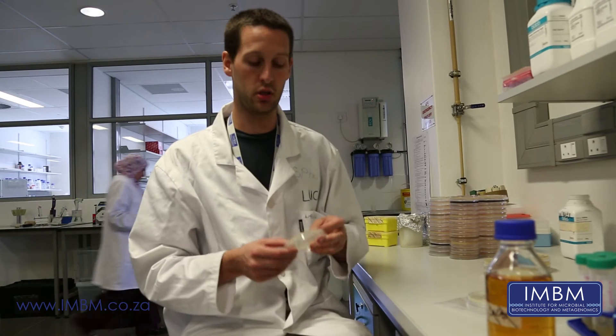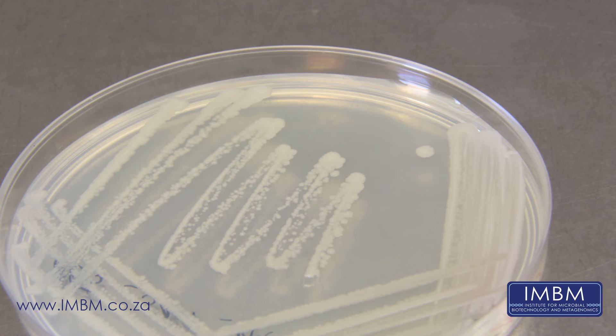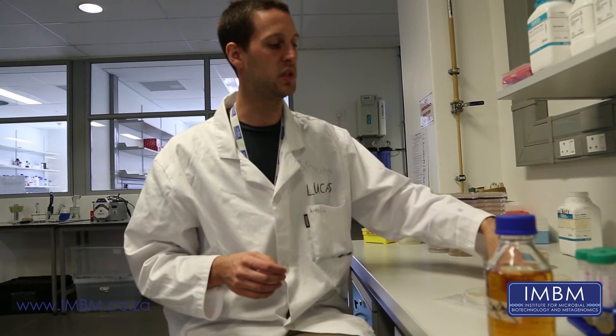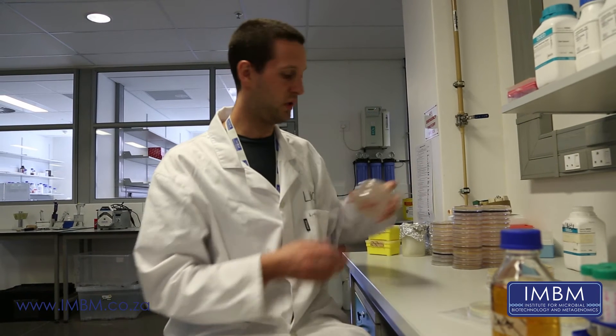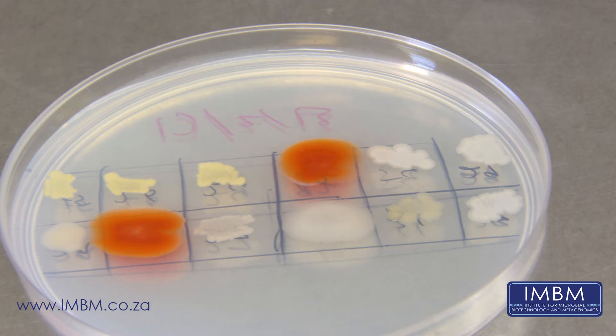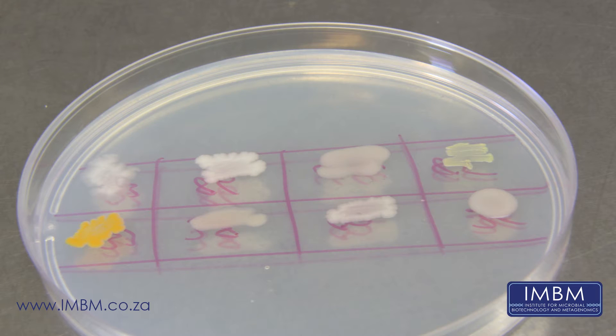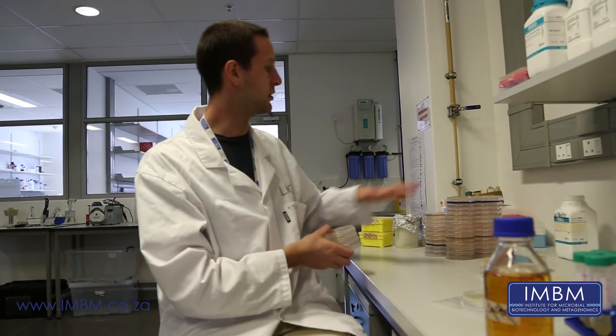We then picked individual colonies, which are streaked out so that they are pure cultures onto a variety of different kinds of media. From that, we plate them out into these assay plates with several bacteria on each one, all different kinds. We have four replicates of each plate so that we can test four different kinds of bacteria all at once.